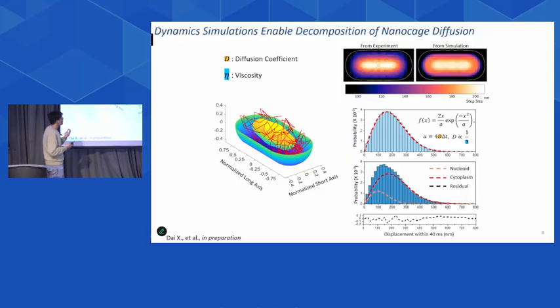And by the Stokes-Einstein equation, the diffusion coefficient is inversely proportional to eta, which is the viscosity in here. And this enables us to quantify the viscosity of the genome for the first time. And we got a value in this case of about 180 centipoise. So you can imagine 90% glycerol mixed with 10% water. So it's very viscous.